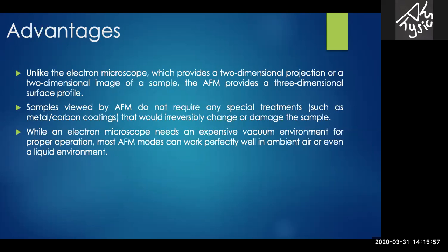that would irreversibly change or damage the sample, and AFM does not typically suffer from charging artifacts in the final image. While an electron microscope needs an expensive vacuum environment for proper operation, most AFM modes can work perfectly well in ambient air or even in a liquid environment.